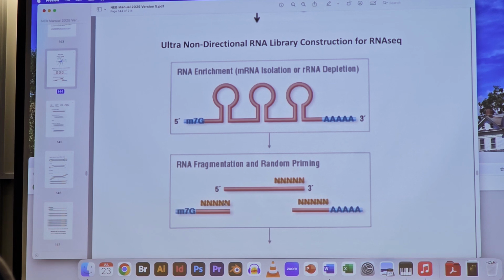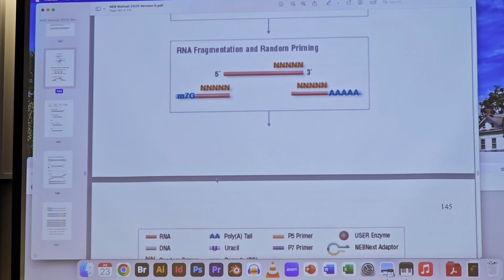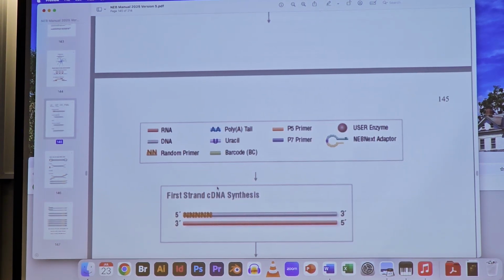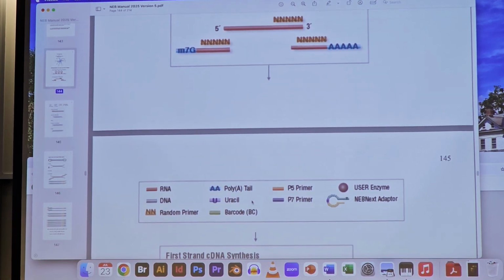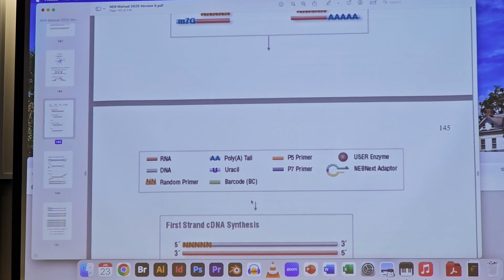So these two are short and it's hard to see in the diagram, but this one, pretty clear. If the random primer hybridizes here, we're going to get this nice cDNA. So that would be first strand cDNA, right? And the first strand cDNA then is down here. This is confusing, and I'm going to get you to flip your brains around here.